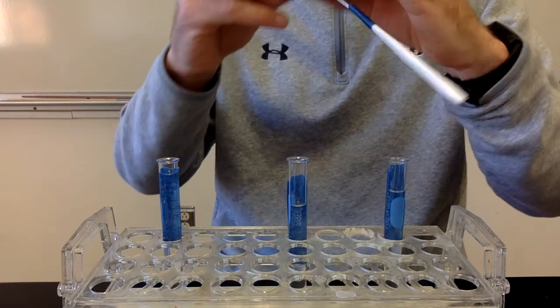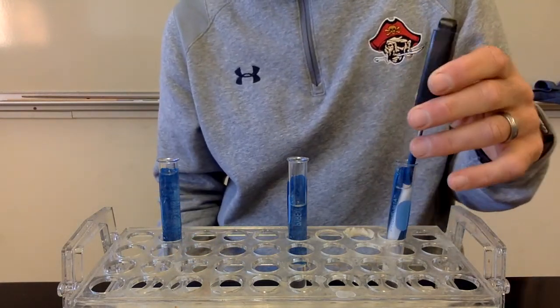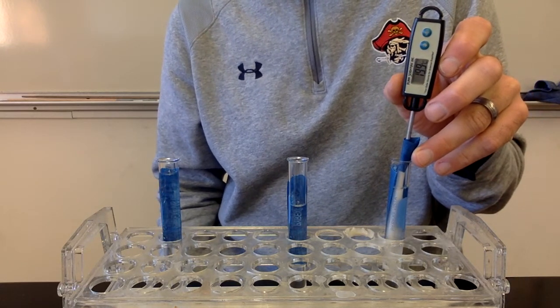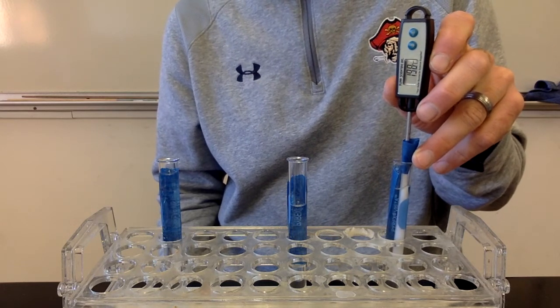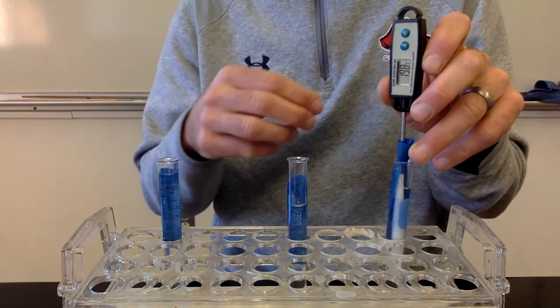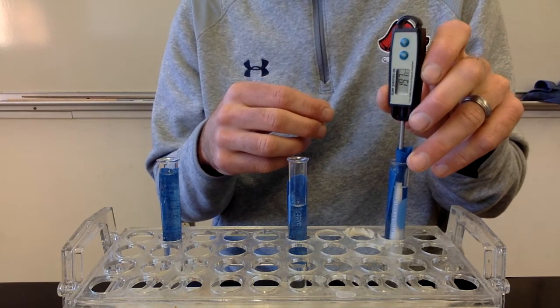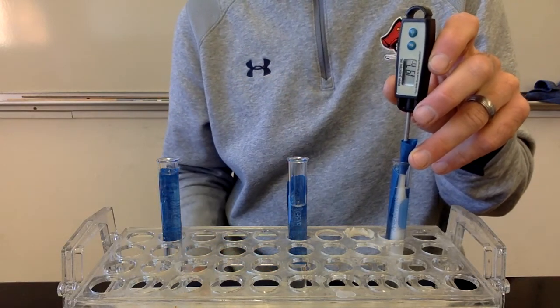All right, so now I'm going to dip my thermometer into the liquid. We'll start with the water, and right now we're just finding the initial temperature of the water. And so the initial temperature of the water as it's a liquid looks like 19.8 degrees Celsius, 19.7 degrees Celsius.